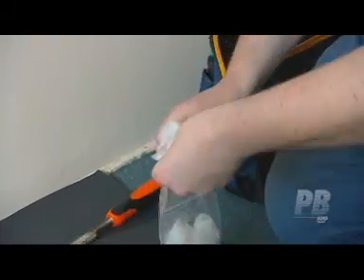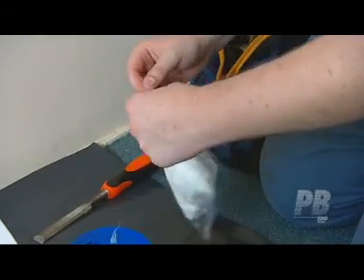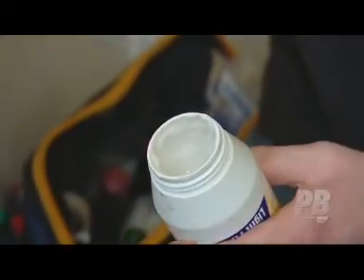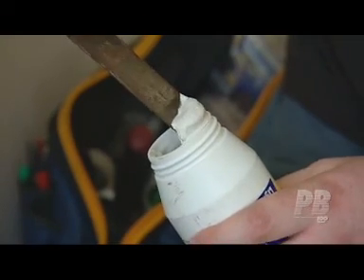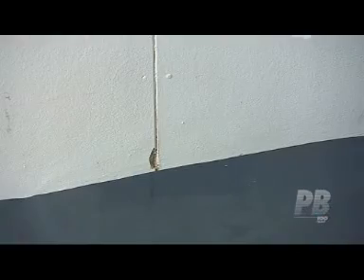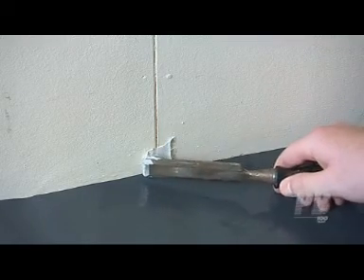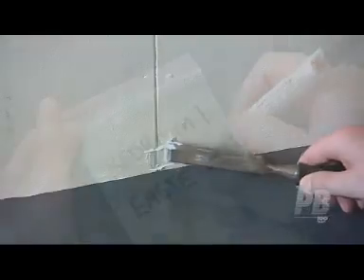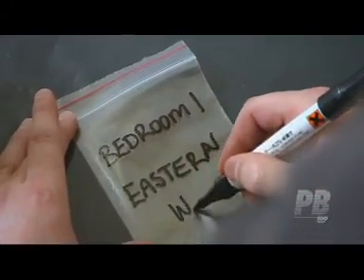All materials that are used for cleaning and decontamination must be correctly disposed of. The sample area should be left clean, with no evidence of debris from the sampling operation. Any sampling points should be sealed with tape or fillers to prevent the release of fibres. Then take a second sample from a different location and pack and label it separately.